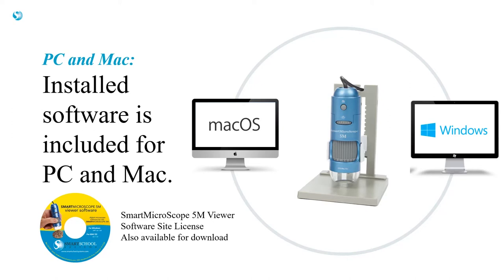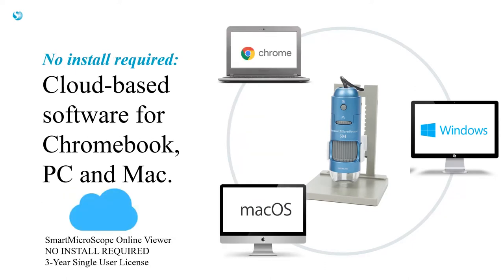It's also available on our website for download if you don't have a CD-ROM drive. If you use Chromebooks or don't want to install software, use our cloud-based Smart Microscope Viewer Online web app. Simply plug the 5M into your computer and log into the website to view the live image, take pictures, and record videos.